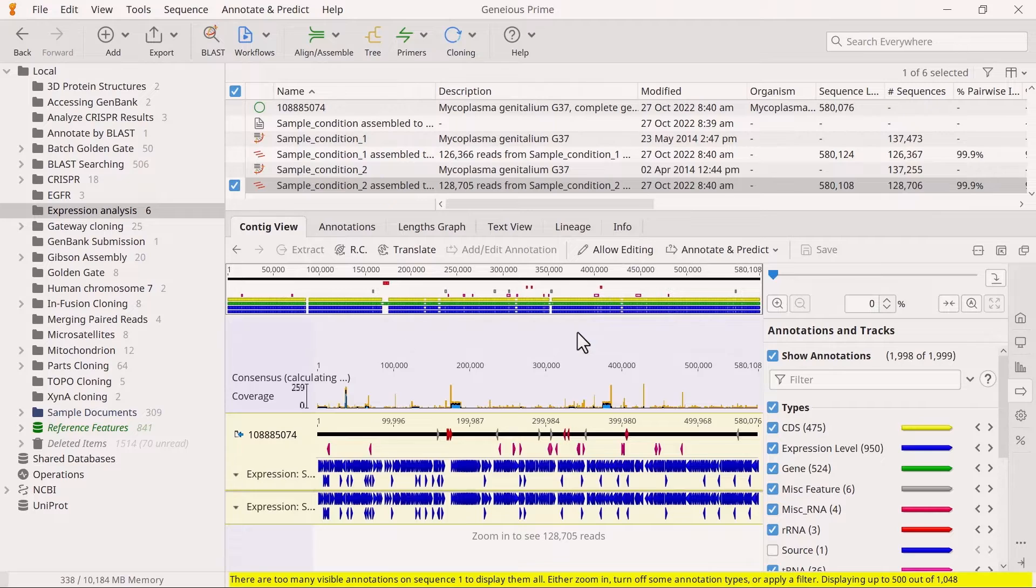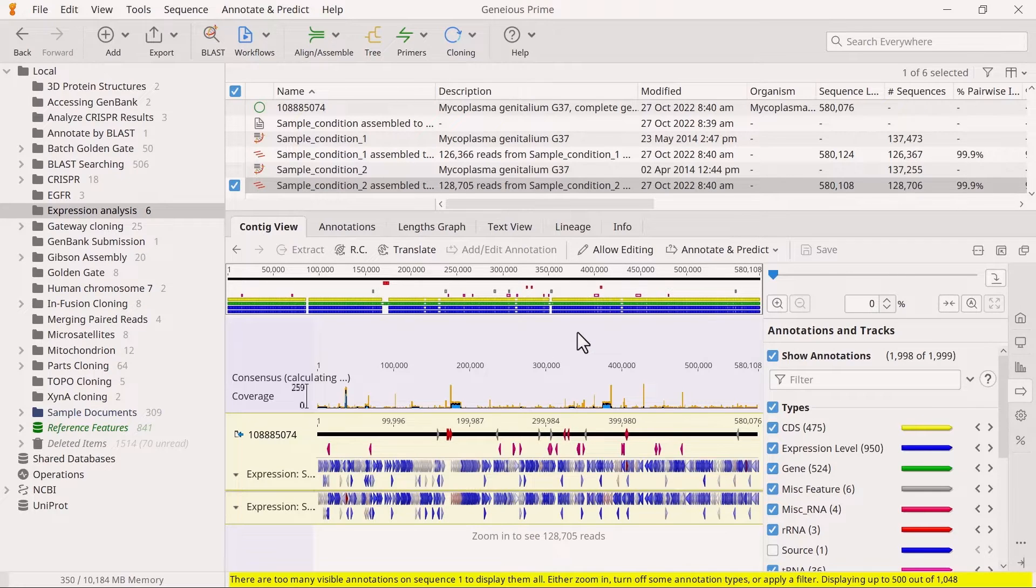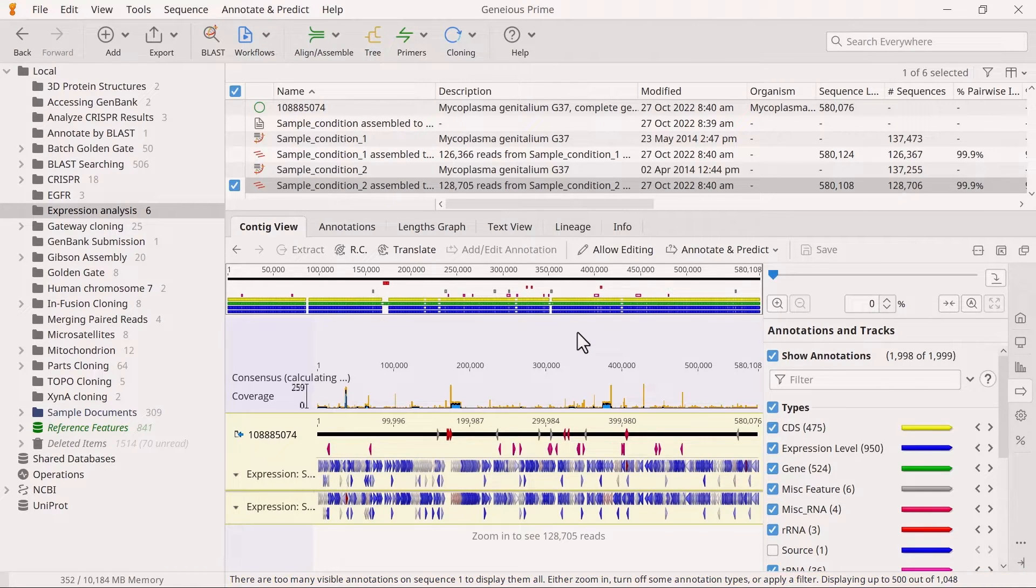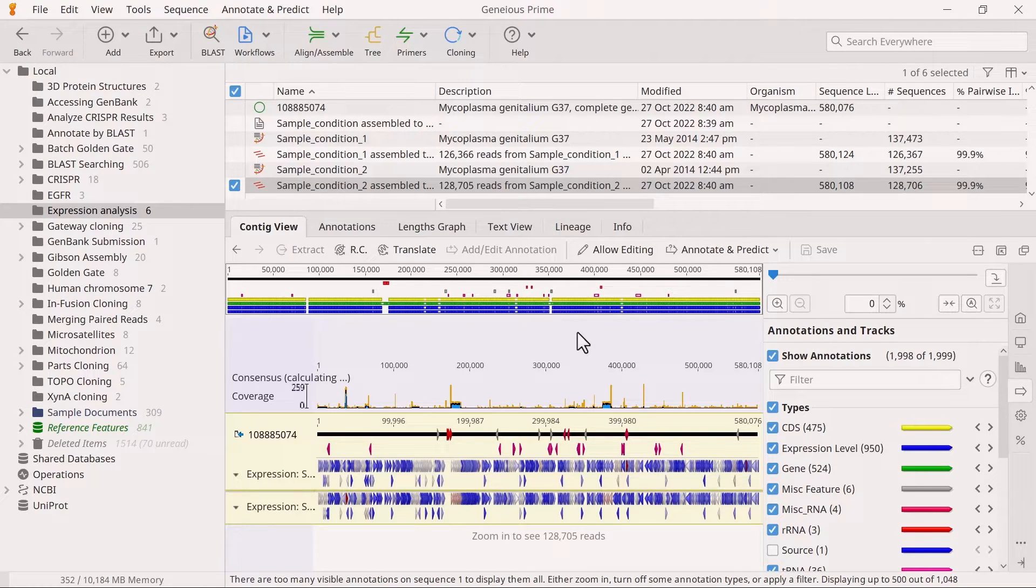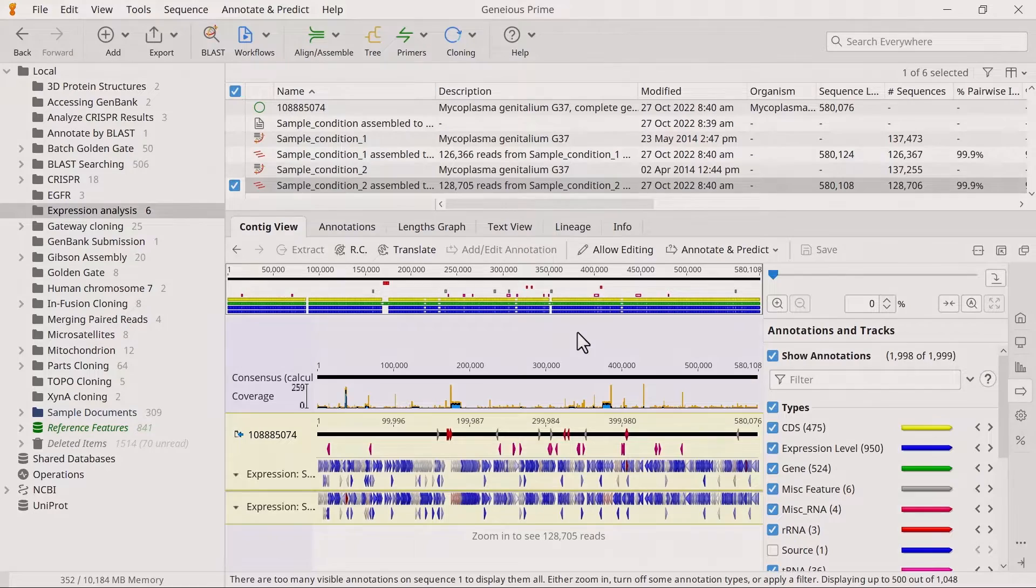However, if you have multiple reference sequences for each sample, such as one set of reads mapped to multiple chromosomes, then all contigs from that sample should be selected and run in a single step.